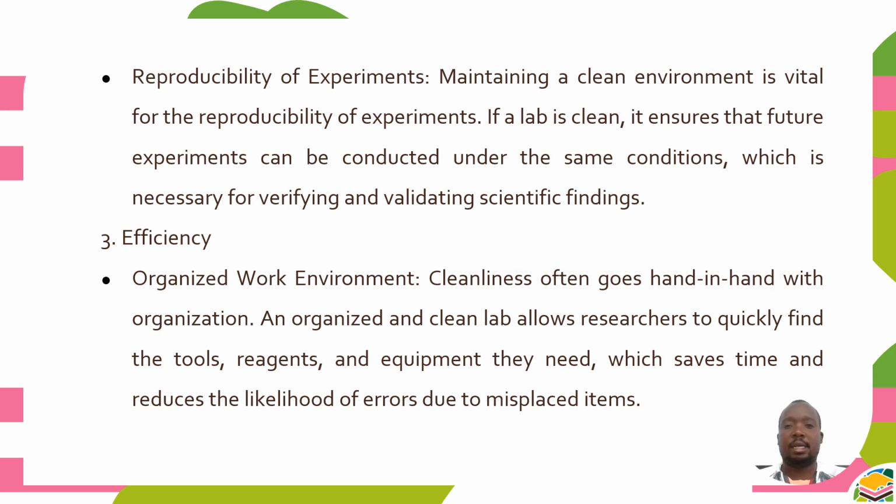So yes, cleanliness ensures efficiency, because if the lab is cleaned, the working environment is also organized. So this leads to efficiency.